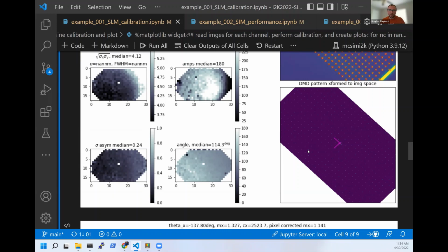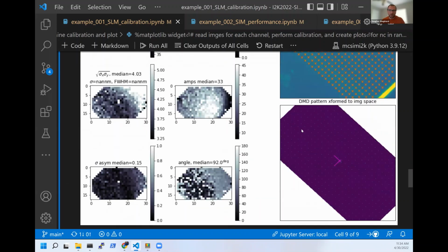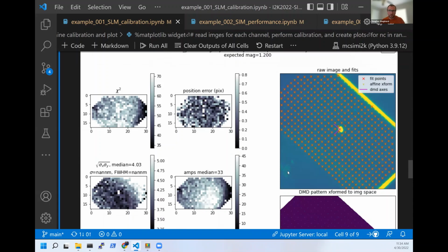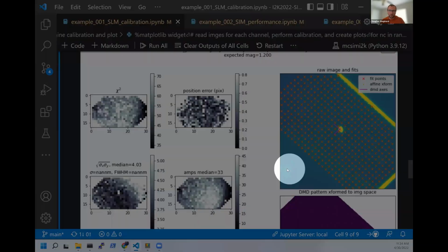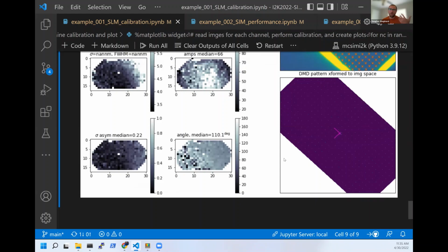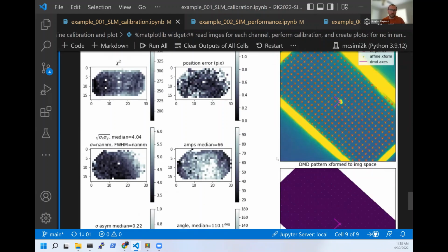And then here's the second laser output. You can see some junk in the dye slide right in this spot right here. And then here's our third output. You can see here the beam is a little bit bigger, so we have a bit of overfilling going on.